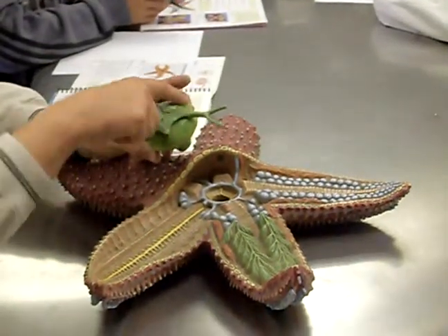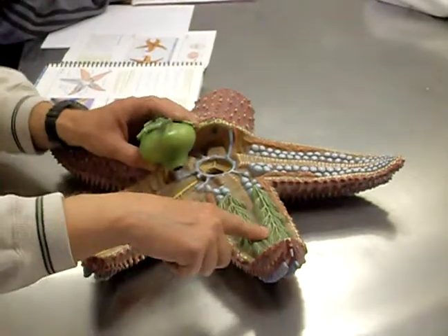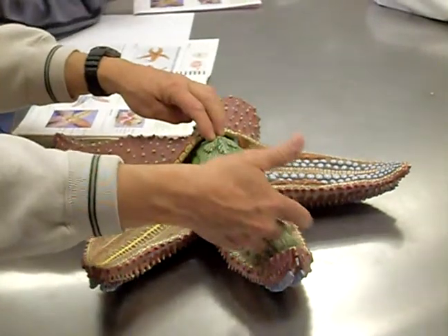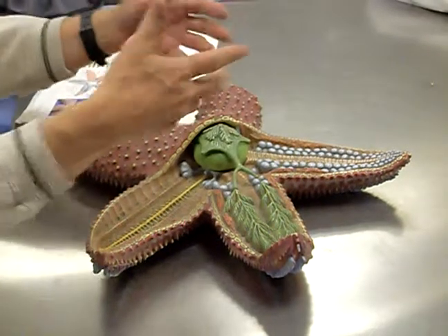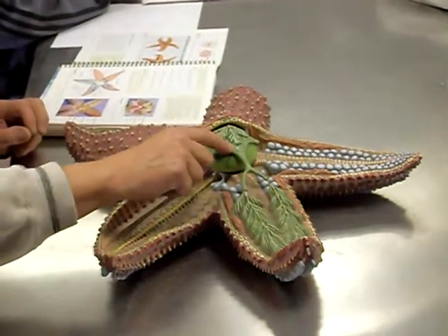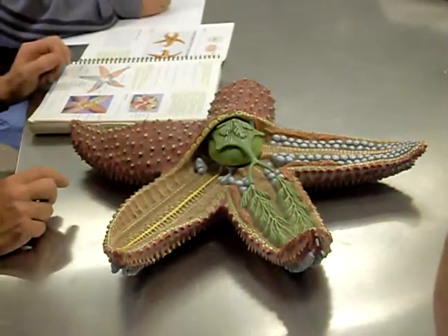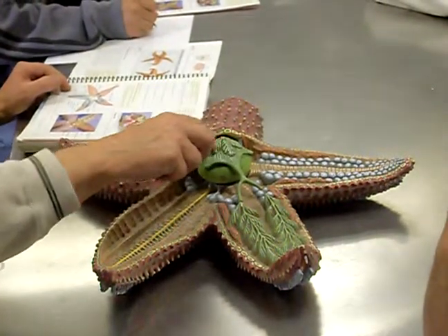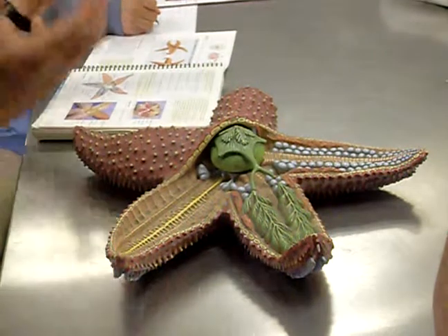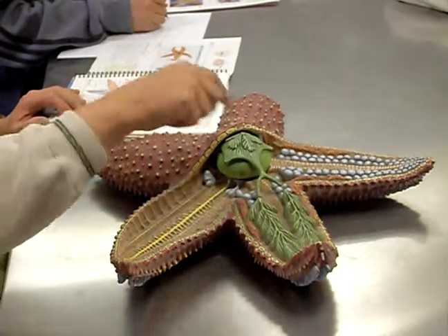The pyloric stomach is this kind of five-shaped structure with a branch connecting to the digestive glands. There's a pair of digestive glands in each arm, and these secrete digestive enzymes that go into the second stomach for further digestion. Coming from the pyloric stomach is a very short intestine, and you can see these little flower-petal shapes radiating out — those are the intestinal ceca, just side branches of the intestine to increase surface area for absorption. The anus then opens up at the top, so mouth on the undersurface and anus at the top.